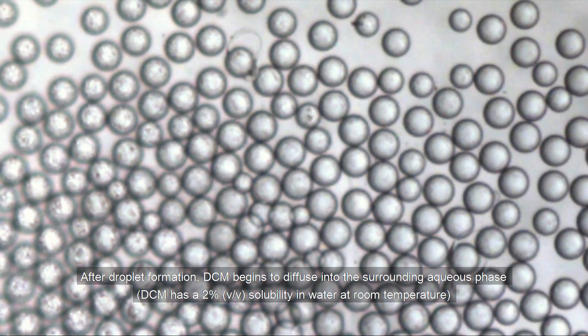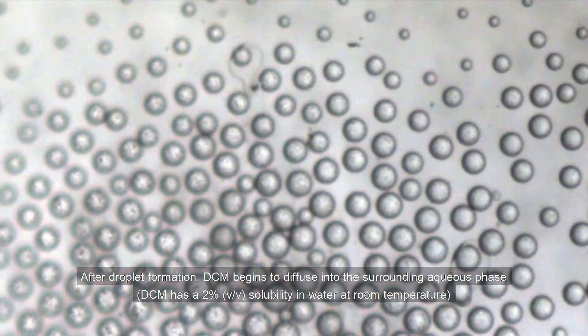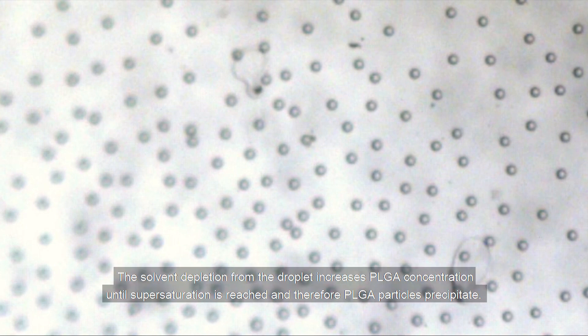After droplet formation, DCM begins to diffuse into the surrounding aqueous phase. DCM has a 2% volume concentration solubility in water at room temperature, thereby depleting the droplets of solvent. The solvent depletion from the droplets increases PLGA concentration until supersaturation is reached, and therefore PLGA particles are precipitated.